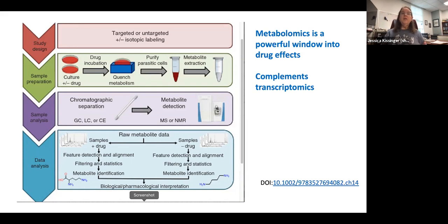It's really powerful. And much like we look at gene expression studies, you have different conditions, right? Under condition 1 and condition 2, you have your reference and your comparator. Now, instead of isolating RNA transcripts, you isolate the metabolites and run them through mass specs. You have ways of labeling and keeping your reference and your comparator separate from each other.